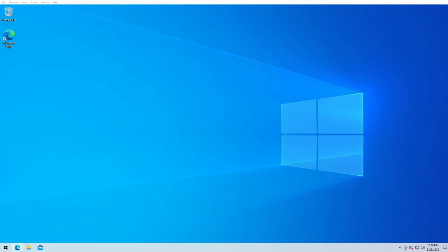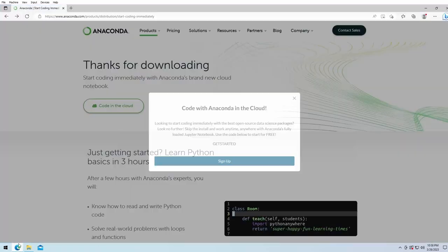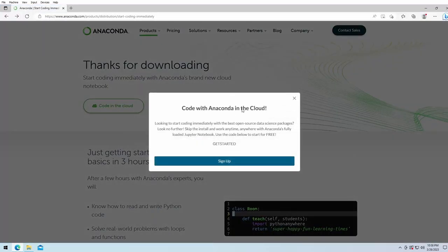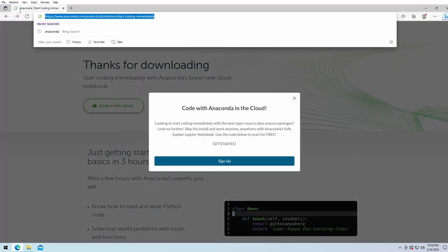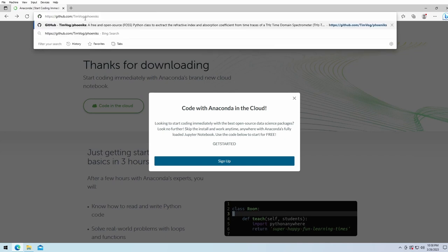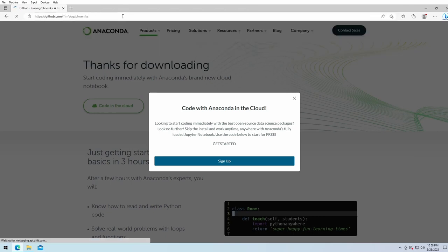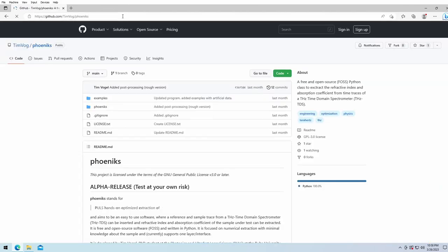After installing Anaconda, open your internet browser and enter https://github.com/TimVog/phoeniks. You can find also the link in the video description below.